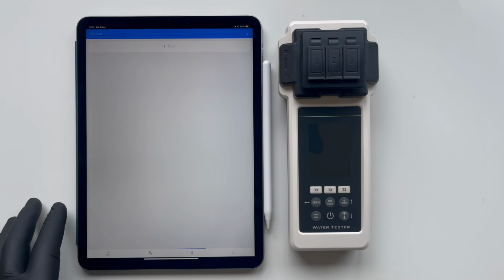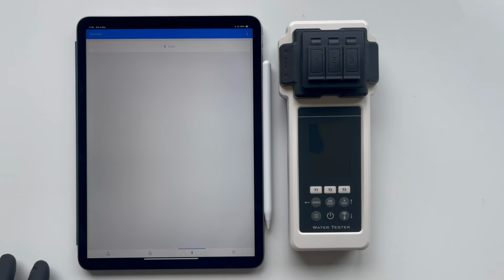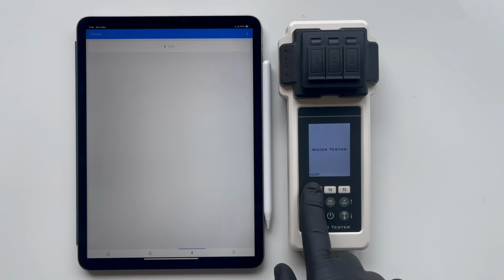So, the update process is complete. We see that the device has turned off. After an update, it's common for testers to shut down and restart. In our case, it turned off, so we need to turn it back on by pressing the on-off button. We see that the firmware version has changed, indicating that the device has been updated.